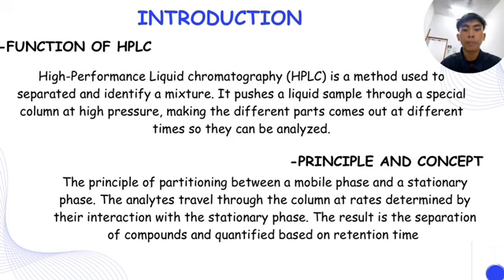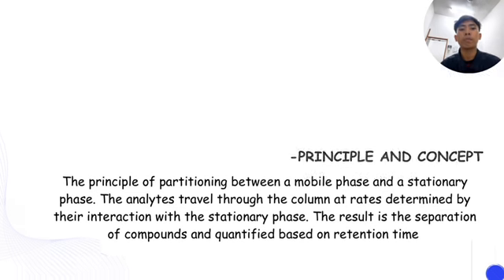Principle and concept. The principle of partition between a mobile phase and a stationary phase. The analytes travel through the column at rates determined by their interaction with the stationary phase. The result is the separation of compounds, quantified based on retention time.